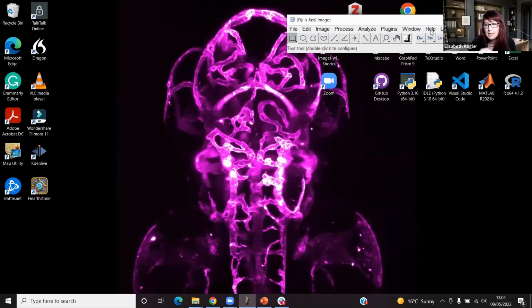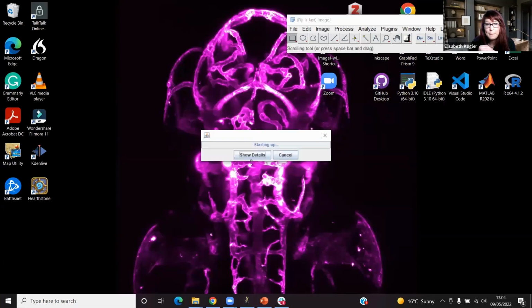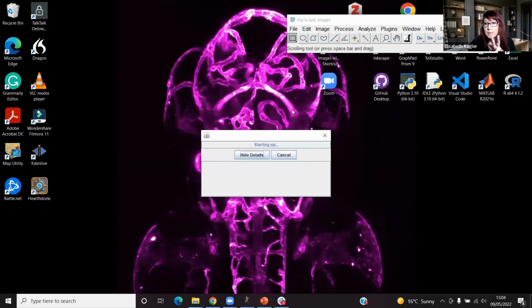Let's quickly walk through Fiji, how we get it ready as well, if that's okay. I just need to share my screen. So in Fiji, we need some update sites, and I don't know if you have done that or not, but basically if you go to update, we need to update 3 different update sites, and that's again in this tutorial guide.